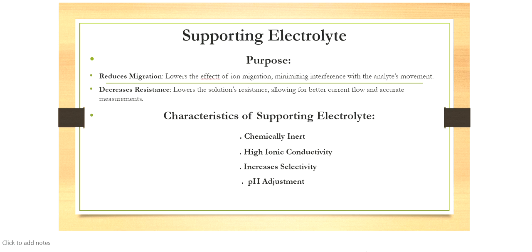And high ionic conductivity provides better current between the two electrodes whenever you want current to flow from electrode to electrode. High selectivity will provide good efficiency in current measurement. And the pH adjustment is good for our equipment safety. It will reduce the corrosion.